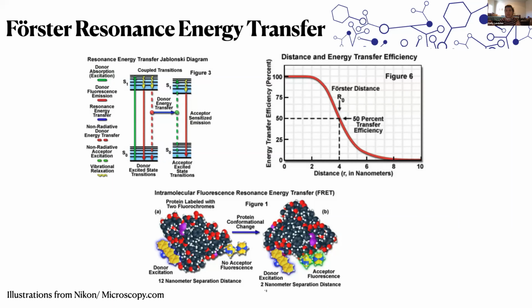One thing that, especially when I first started in tech services, a lot of people were trying to set up their own FRET assays without completely understanding that an antibody to an antibody is not necessarily FRET, because it depends on the localization of the two fluorophores and the distance between those two fluors. That's the FRET, not the biomolecule necessarily. Our tools are only reporting what we hope will be the distance at a certain angstrom between two things. And so that relationship between distance and fretting efficiency is something obviously that we can quantify.